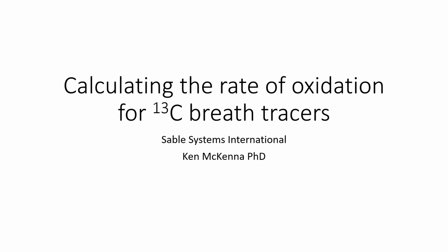Hello, my name is Ken McKenna, and today I want to introduce you to calculating the rate of oxidation for carbon-13 breath tracers using data collected from Sable Systems' Stable Isotope Analyzer. In this talk, I will show you how to combine information about total rates of carbon dioxide production with simultaneous measurements of carbon-13 levels in breath to calculate the rates of tracer oxidation.